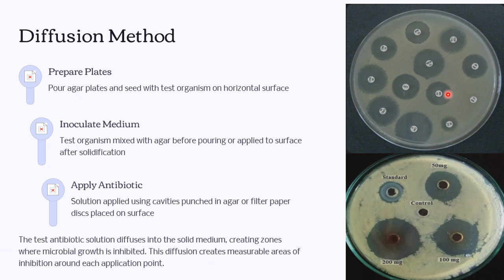Then the plates are incubated, during which the antibiotic solution diffuses into the medium and inhibits the growth of microorganisms. That is, the plates are incubated, and during the incubation the antibiotic solutions present in the disc or in the cavities diffuse through the agar medium, and kill or inhibit the growth of microorganisms around the area in which the antibiotic solution has diffused.